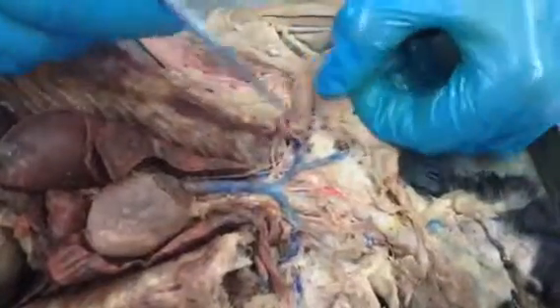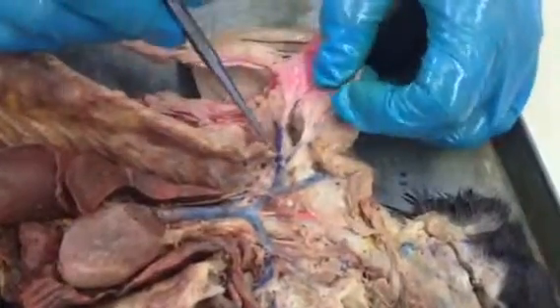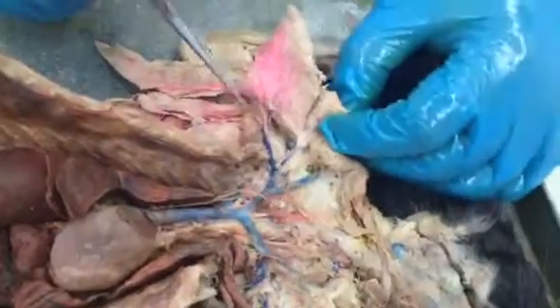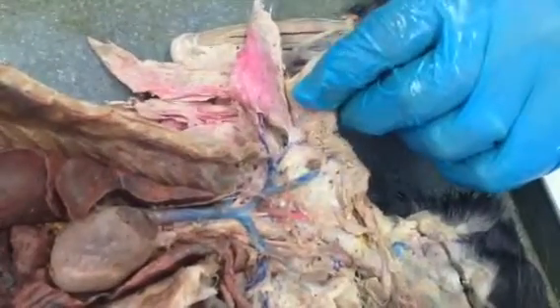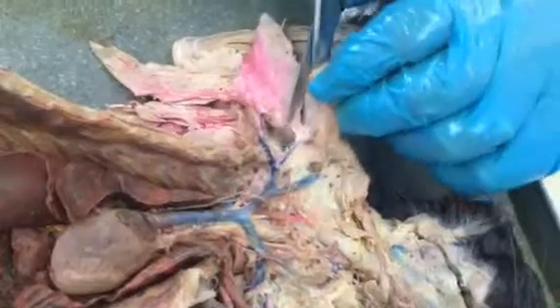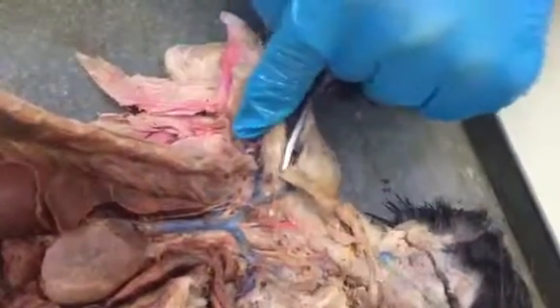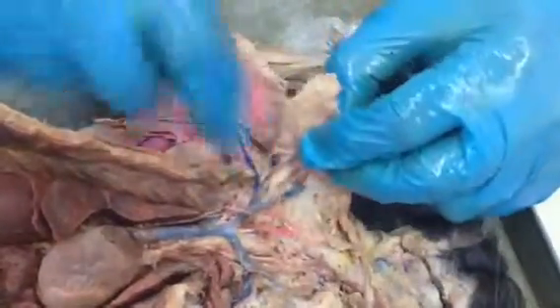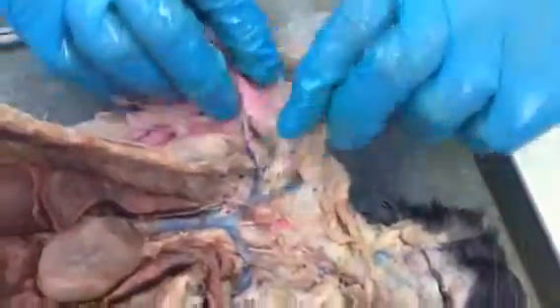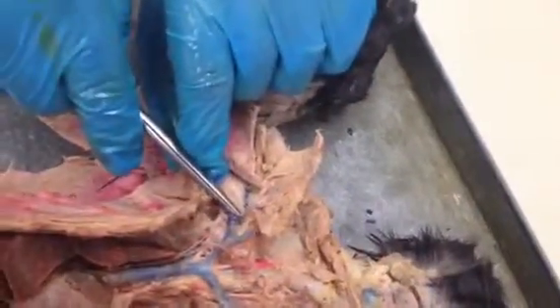As we move out onto the arm, the subclavian becomes the axillary, and the axillary has 2 major branches. The first one is the ventral thoracic. This is the ventral thoracic vein. Right next to it is the ventral thoracic artery from the arterial system, which we'll point out a little bit later. But that's the ventral thoracic vein right there.